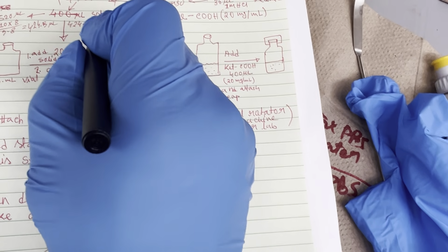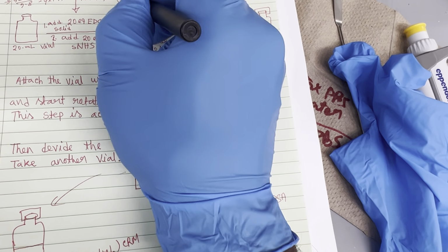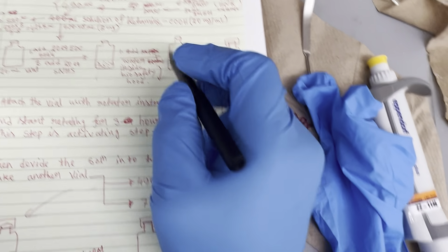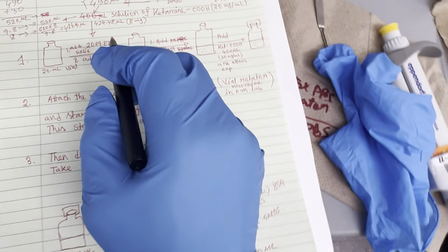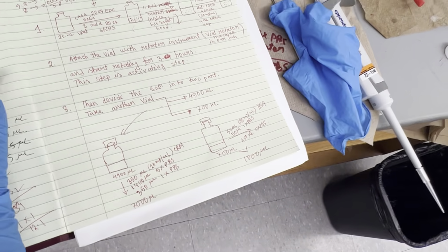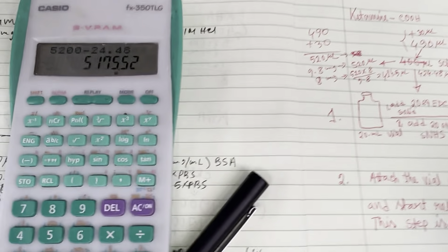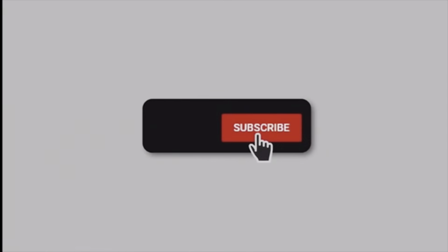If you take 424.48 microliter, then it will have a total of 8 milligram. And because we are adjusting this for the HCl acid solution in the water, we will use here not 5200 microliter. We just remove the 24.48 microliter from this 5200. So 5200 minus 24.48, it will be 5175.52 microliter.